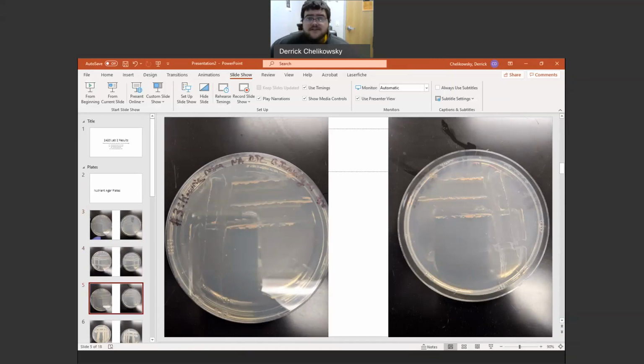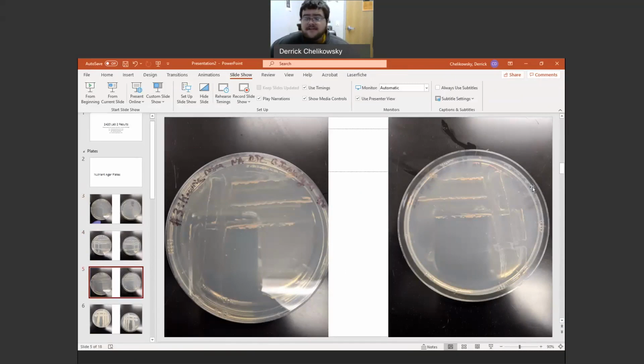And chromogenesis is just a changing of the colors. Some of them really make it obvious what they are. Kocuria rosea is pink. Kocuria rhizophila is a yellow color. Your Sarcina aurantiaca is orange. And the chromogenesis is a big way of determining what you're looking at from an outside perspective.